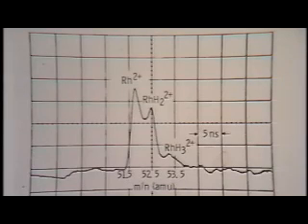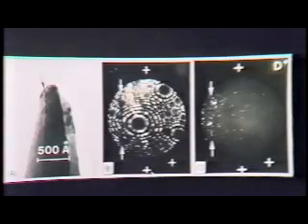So it's very hard to do isotopes up at that range, but you can still resolve something about them. That's mass resolution. What about pictures?